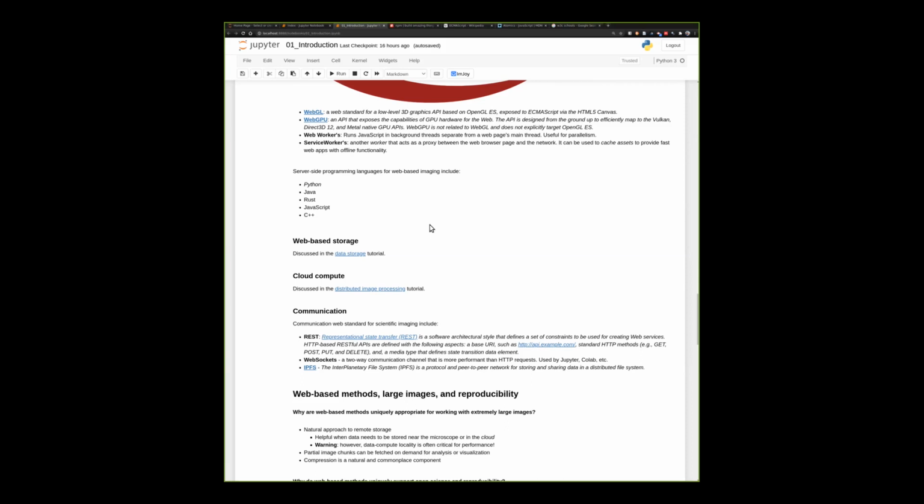Other terminology that you might hear when you're doing this work is REST. And REST is a way of communicating over HTTP. You'll hear the term RESTful APIs, and that's how you request information and get information and transmit information over HTTP over the network.